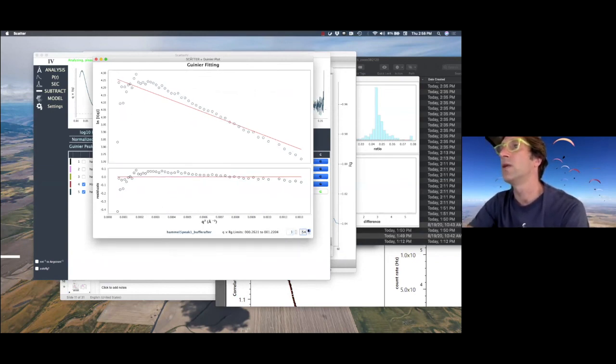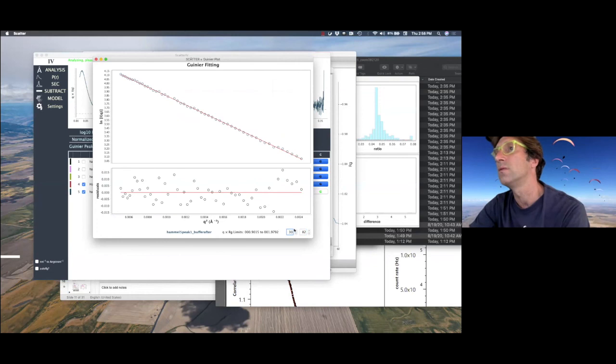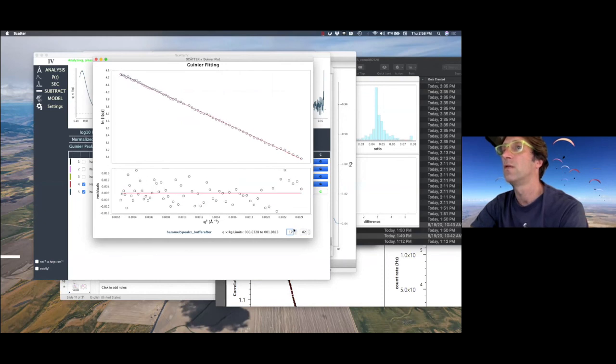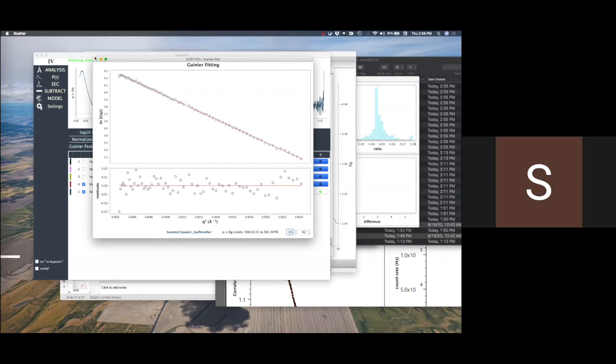But I know it's a size exclusion, I don't expect aggregations. So I just basically take those data out, and I still have a nice linear Guinier. This is the fast way. But if you want to be sure, you're exactly right. Before and after, I mean. Here it already tries to be problematic. So first 15, 16 points can be deleted. Great. Thank you. That's the fastest way.